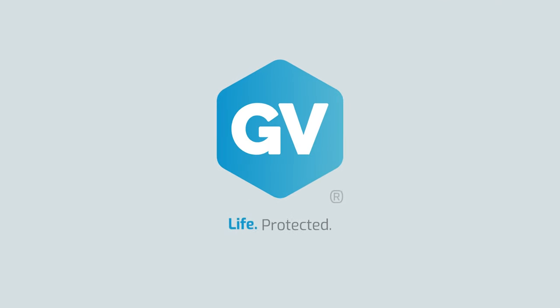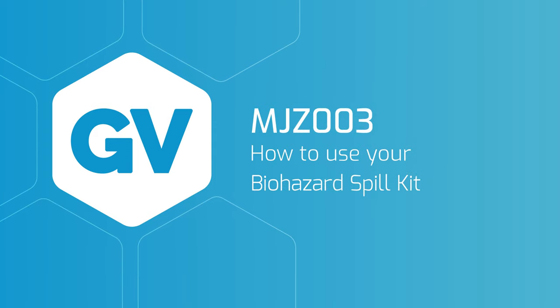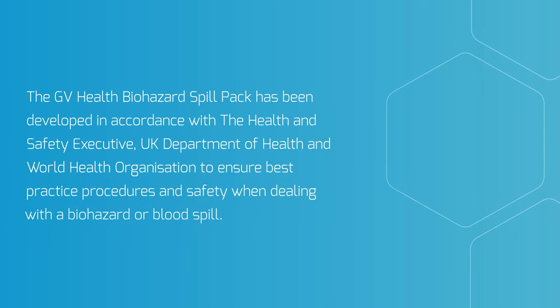GV Life Protected. How to Use Your Biohazard Blood Spill Kit. The GV Health Biohazard Spill Pack has been developed in accordance with the Health and Safety Executive, UK Department of Health and World Health Organisation to ensure best practice procedures and safety when dealing with a biohazard or blood spill.